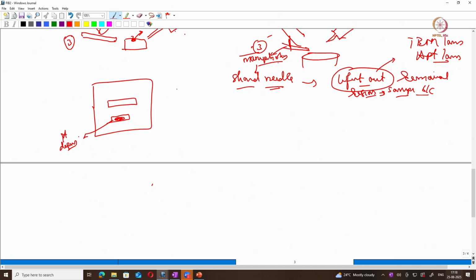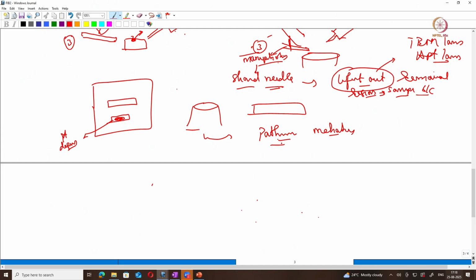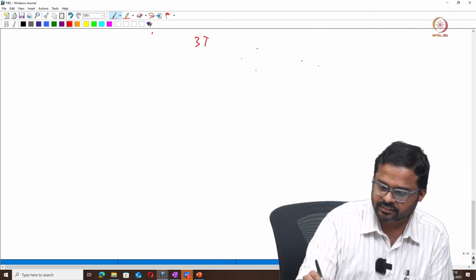Then also you can mill the sample in such a way that you can extract different shapes of specimens, either a cylindrical rod or a lamellar, okay, based on the requirement. Okay, so this particular usage we call patterning. You can use different patterns on the sample surface by using the gas assisted injection system or gas assisted deposition. One more important application for this is the 3D reconstruction.